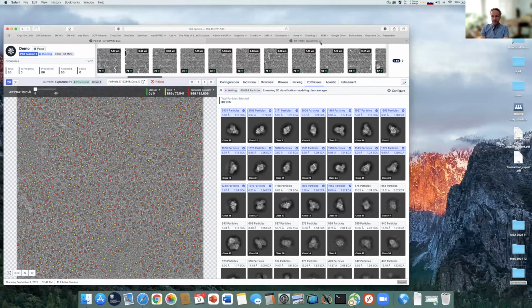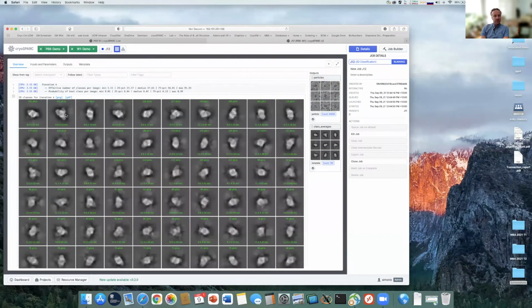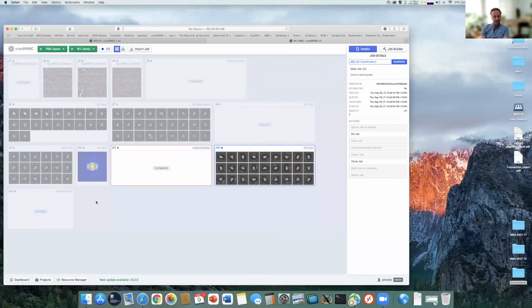And let me just go back to here. Okay, so you can see this is moving along. The side job is moving along quite well, and we're on iteration 4. So that will continue to move. Simon, yeah, please go ahead.